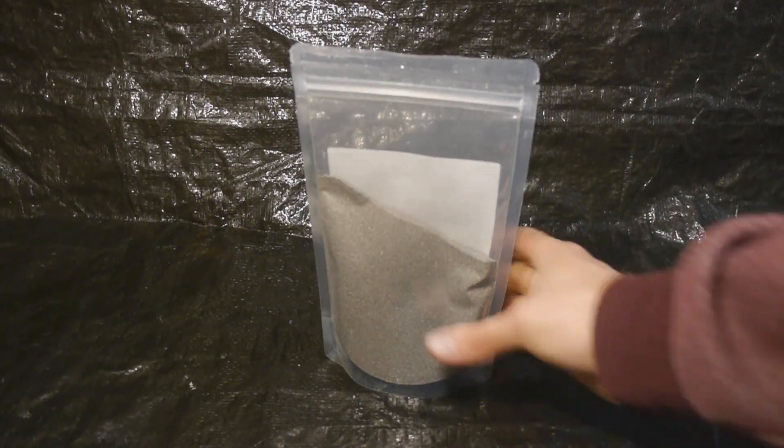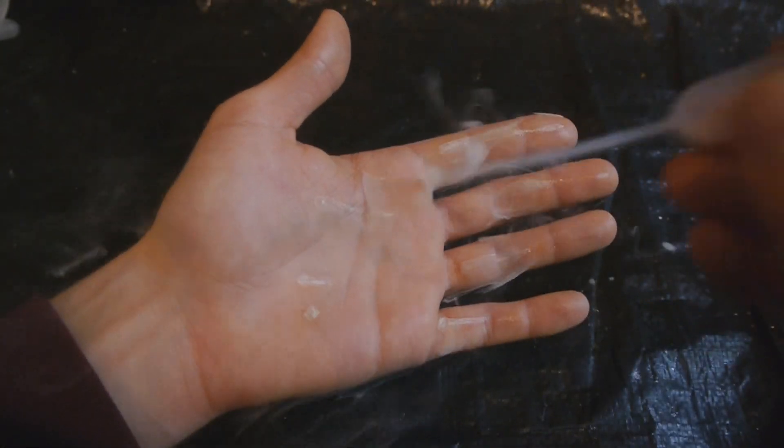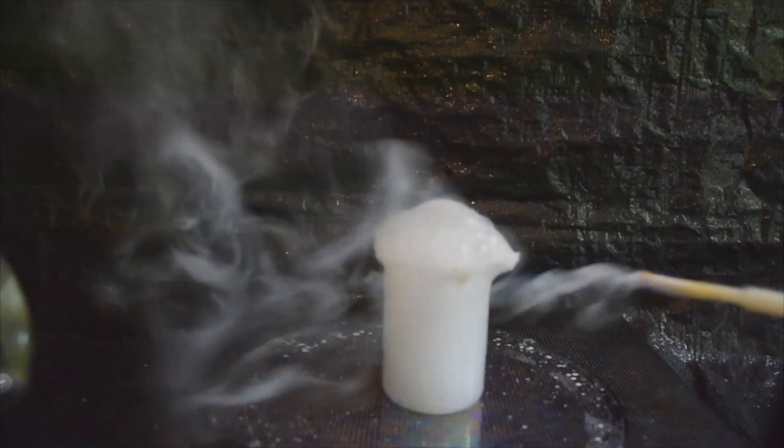Hi, in this video I'm going to show you how I'm going to turn this titanium powder into one of the most fuming liquids on earth. The liquid I'm talking about is titanium tetrachloride, so we're going to have to react the titanium with large amounts of chlorine gas. Chlorine is a poisonous, toxic, yellow-green gas. So as you can imagine, this will be lots of fun.